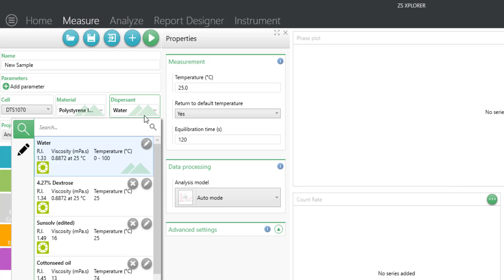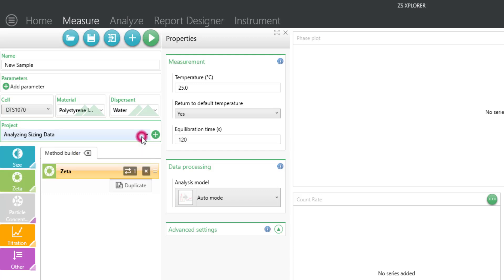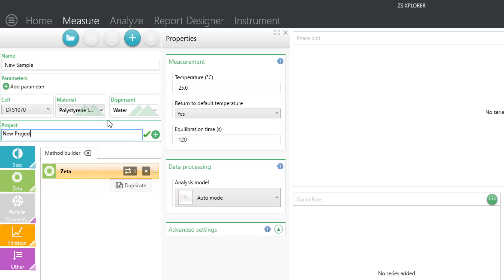You can also add your own unique dispersant to the library by using the edit button. In this case, we'll select water. Select the project name for the location where the data will be saved, or create a new project and hit the green checkmark button.